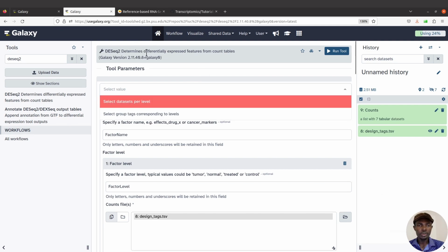Another reason is that if, let's say, you have datasets that are of similar formats, or you have datasets from different stages but the same format, and you are going to use the same tools to analyze those datasets, then all the more reason why you need to create your workflow, so that all I have to do is to specify the input files and then just run it.